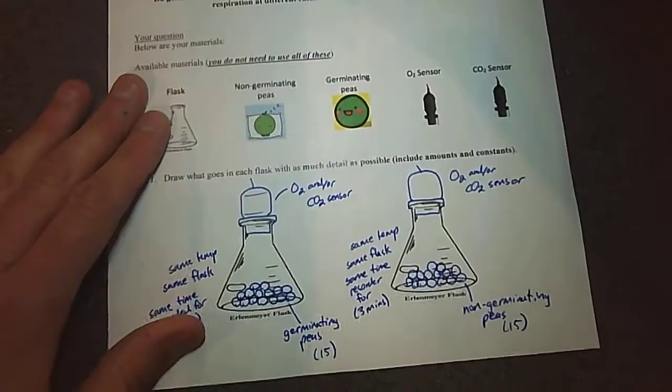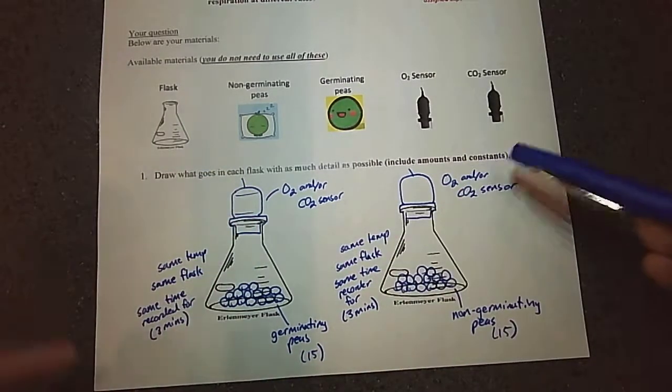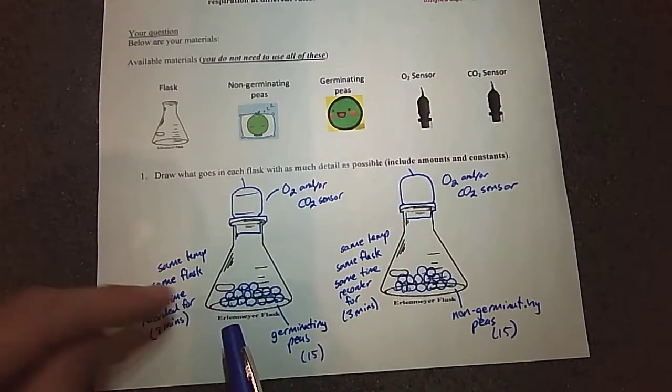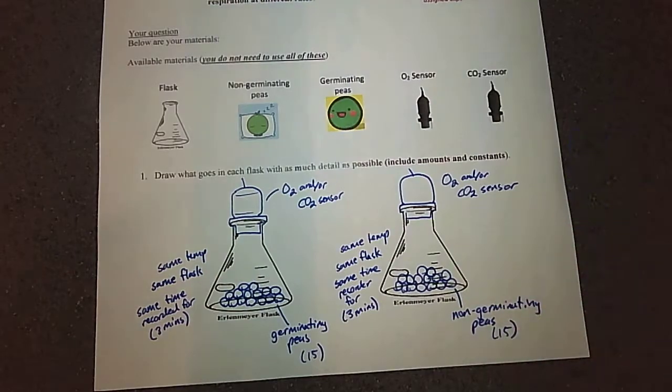So again, independent variable, germinating peas versus non-germinating peas. All right. I'm using the oxygen or CO2 sensor, and then I'm also including other constants and parameters. So I said in this experiment I'm going to test 15 peas each. You might have had a different amount. I said I'm going to use the same temperature, same type of flask, and then the same time I'm going to record for 3 minutes. That's my parameter. Okay?